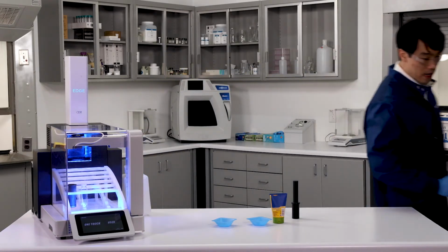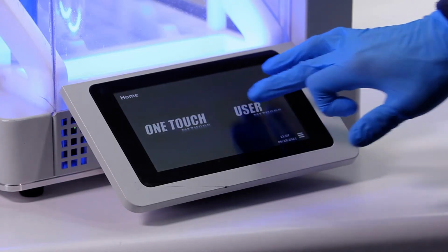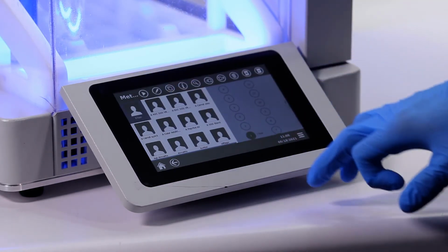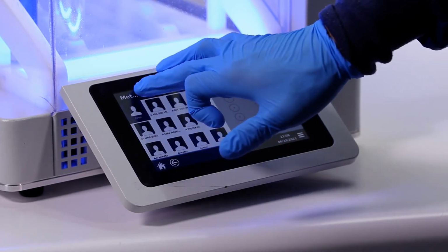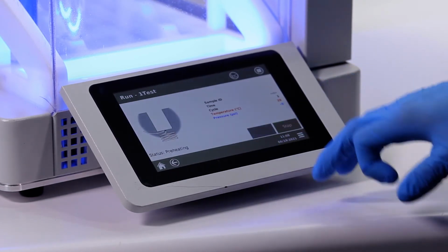I'll go ahead and come around front, select the method we're going to be using, load it into the Q, press play, press start, and the Edge is going to run for a few minutes, so I'll see you guys after that.